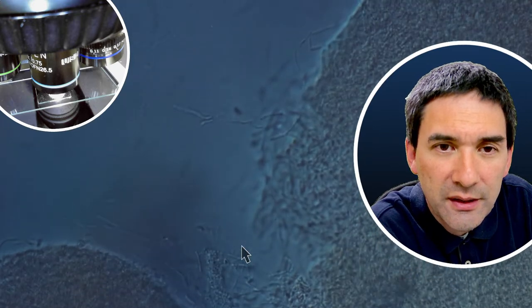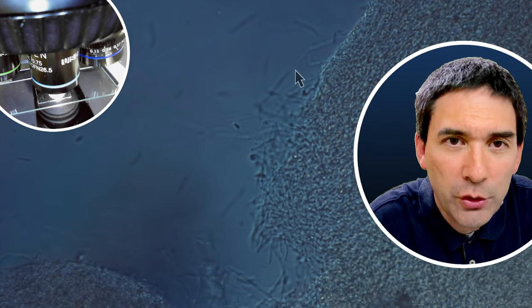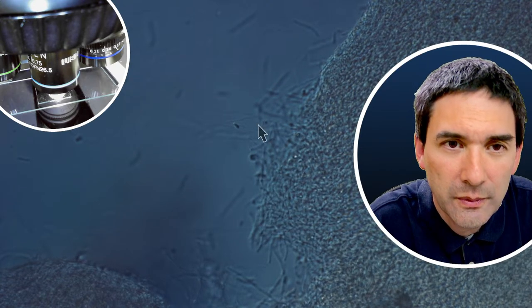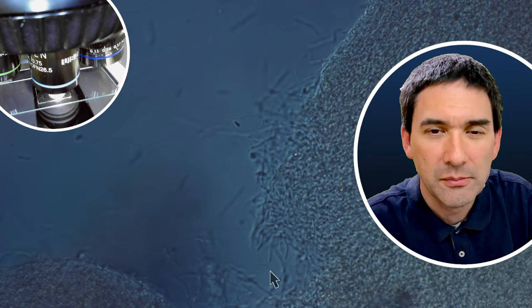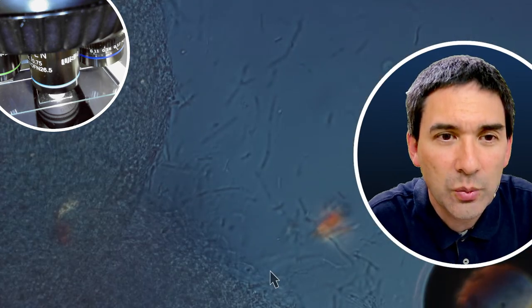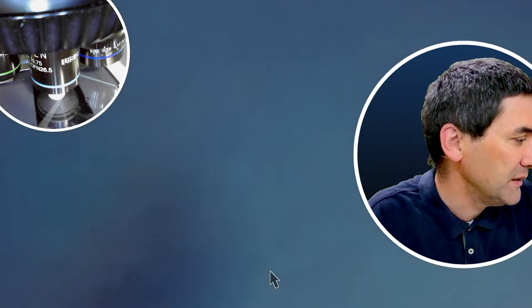But here we see the individual hyphae, which are basically the cells of the fungus. I did not separate well, but which I made last week. But I think as we see, it's way too dense. Here we see the cells better. It's way too dense and the contrast is not very high. So maybe I should have stained it.